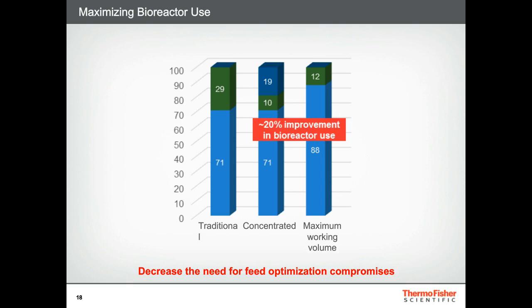As an example, for a 100-liter bioreactor experiment using a traditional 30% total feeding process, the starting volume of the bioreactor would be around 70 liters. This would leave room for the 30 liters of feeding. If a super concentrated 3x GlycanTune Plus or an EfficientFeed Plus feed were to be used, that 30 liters is now decreased to only 10 liters, leaving room for roughly 20 liters of culture.